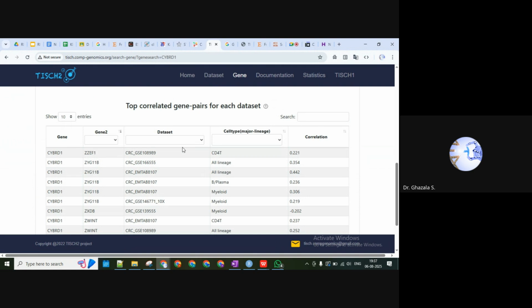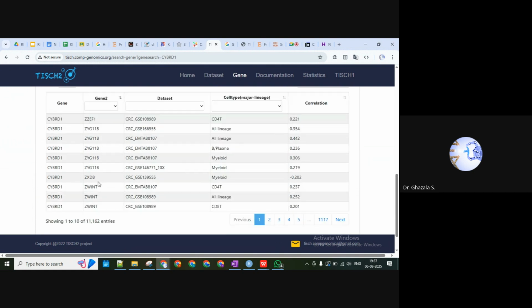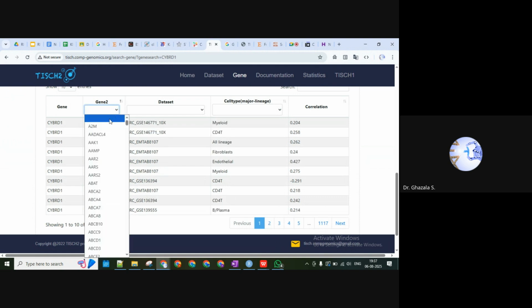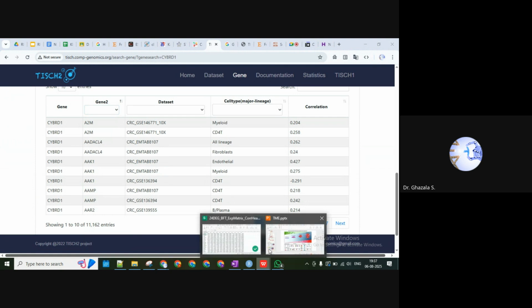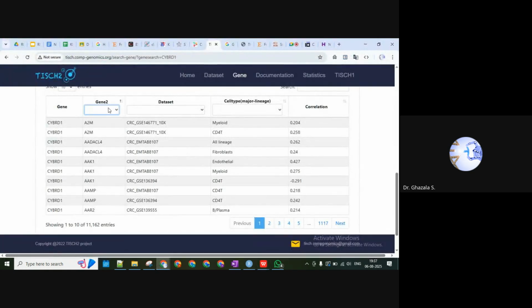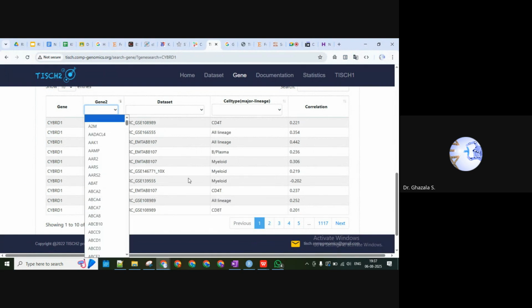Once we download this particular information, we can also check for a specific gene that we are more interested in. Okay, so we can select the gene, for example, to see if it's in our list or not. Let's say TGFBR3. If we check for the gene, then we can see if there is any relation, or whether a cell type is present or not. Just a minute.